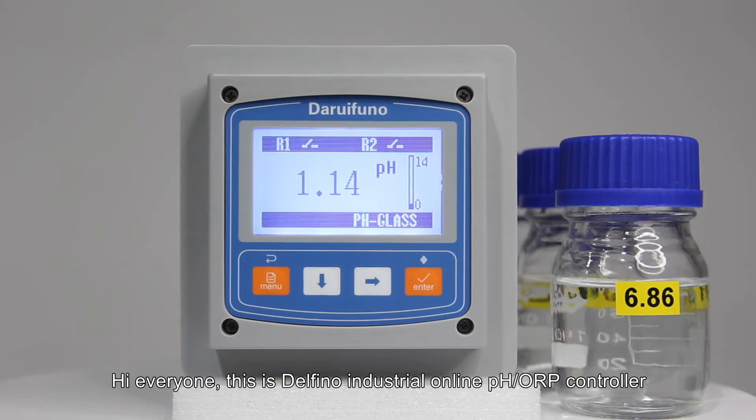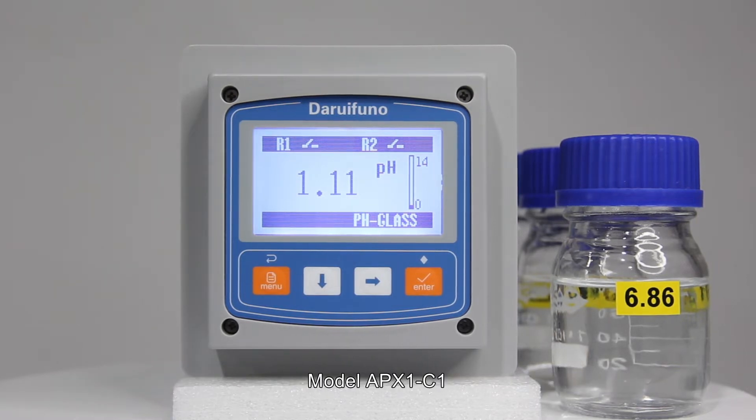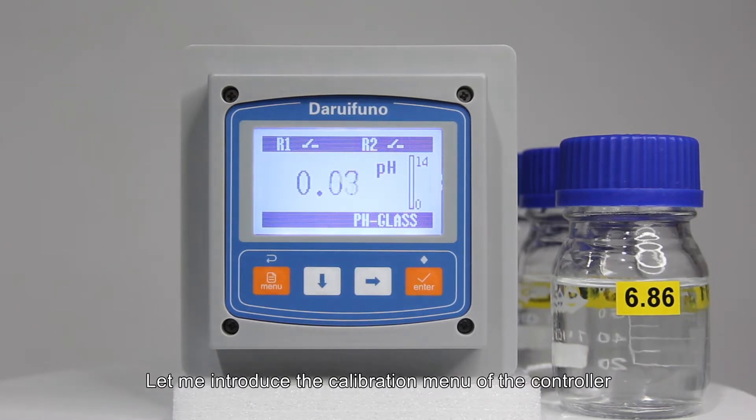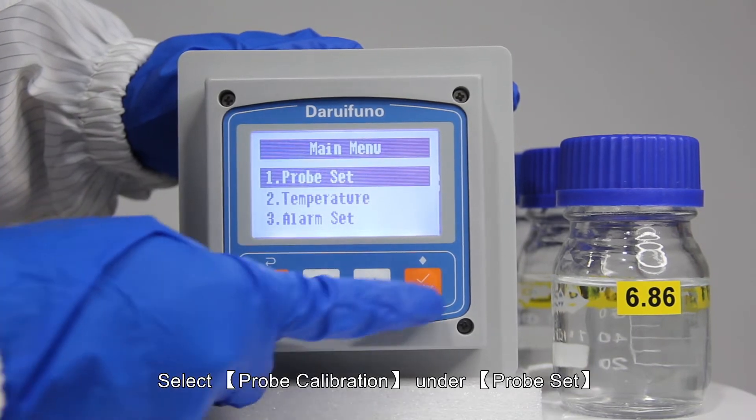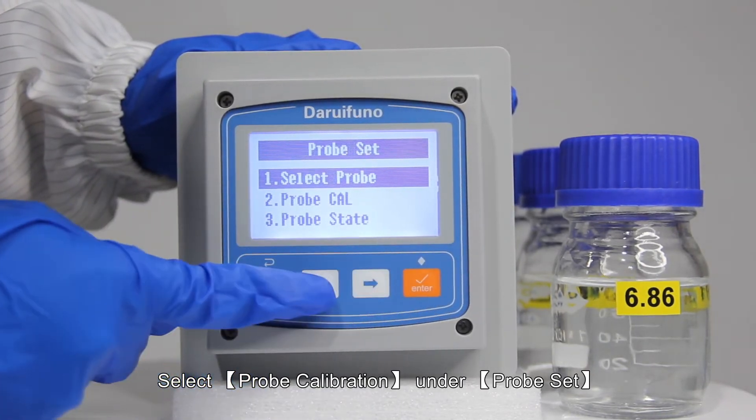Hi everyone, this is Daruifuno Industrial Online pH/ORP controller, model APX1C1. Let me introduce the calibration menu of the controller. First, long press the menu button to enter the main menu, then select probe calibration under probe set.